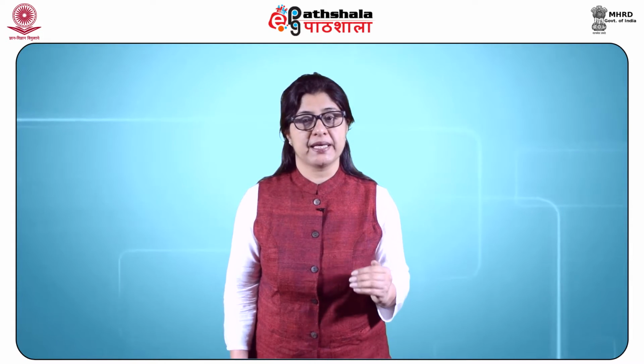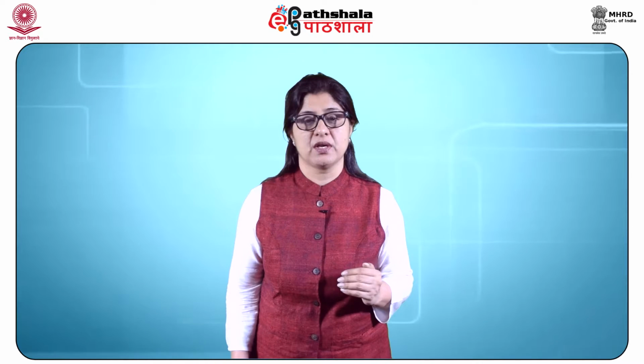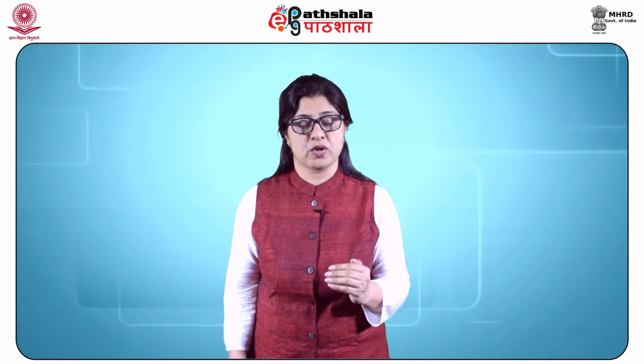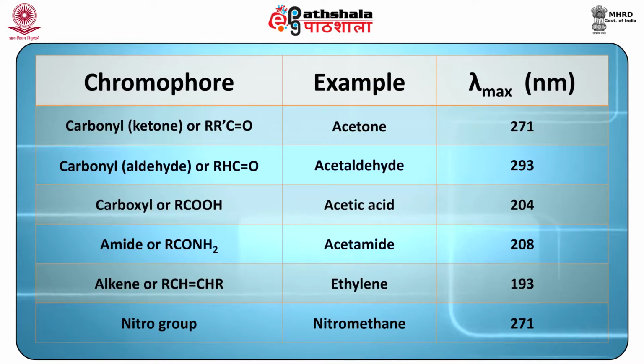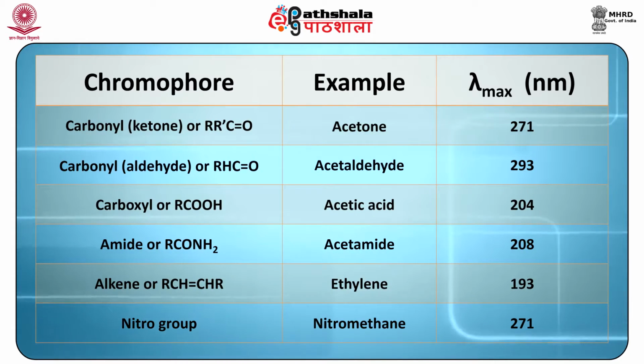Most of the absorption bands in the UV visible spectra of various compounds result from the presence of unsaturation in their structure. A chromophore is a molecular group which is responsible for absorption and usually contains an unsaturated bond. When inserted into a saturated hydrocarbon, which exhibits no UV visible absorbance spectrum, it produces a compound with absorption between 185 and 1000 nanometers. Some common chromophores and their absorption maxima are listed here in the table.